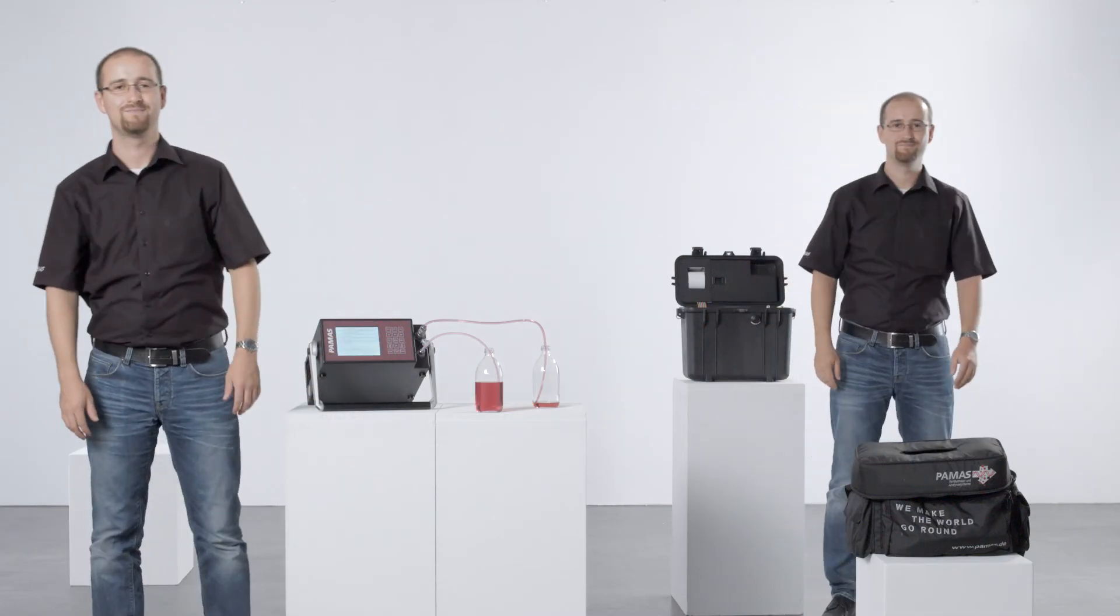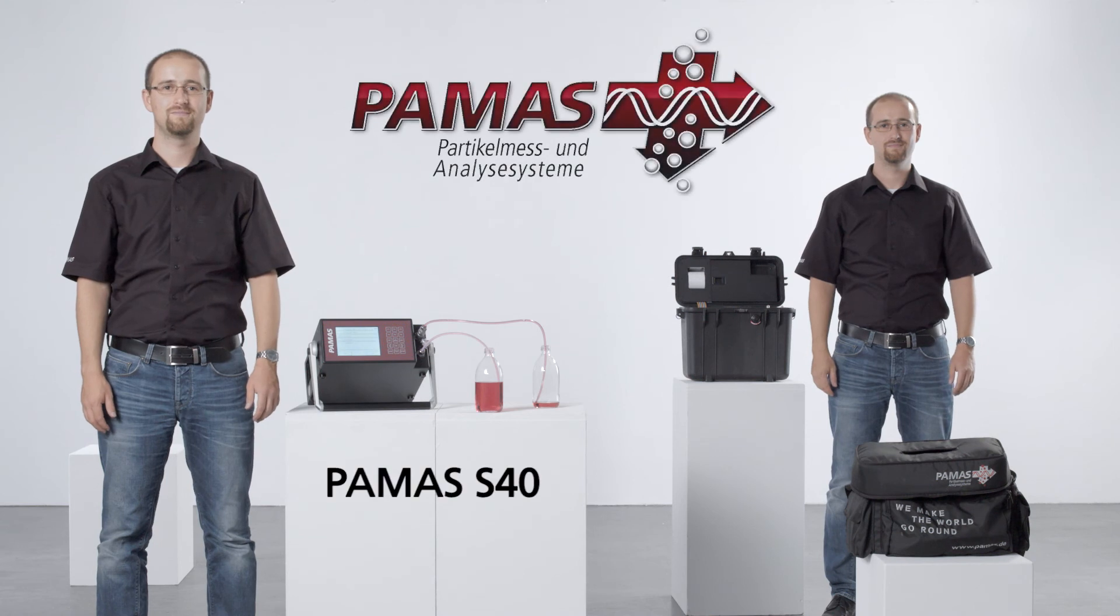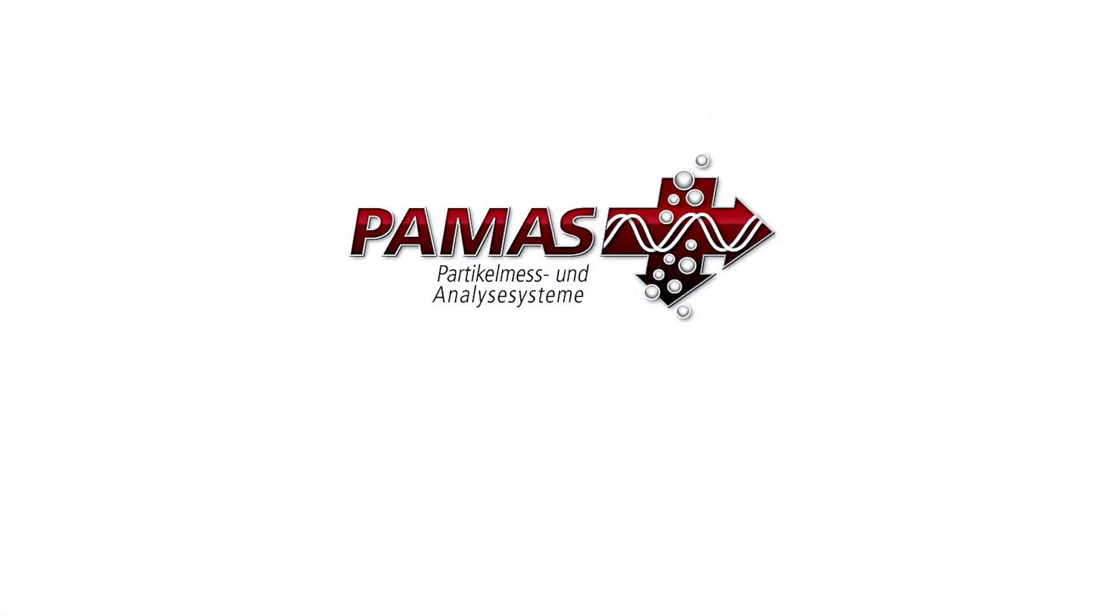The PAMAS S40 – the portable particle counter with the precision and accuracy of a laboratory instrument.